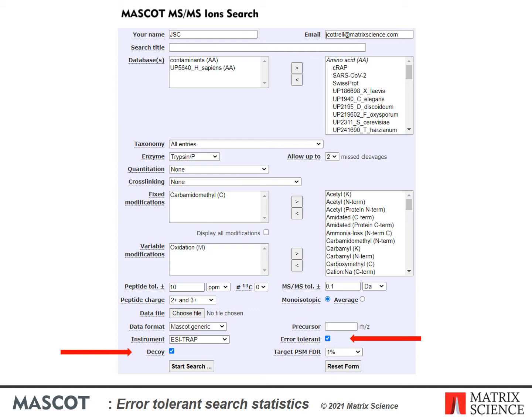Without a decoy, expect values are derived from counting trials. That is, counting the number of candidate peptides that we test to try and get a match. This estimate is not always going to be super accurate, particularly when there is something wrong with the choice of database or with the search parameters, which means that a large fraction of potential matches are unavailable. Ticking the checkbox to search a decoy database gives us a solid empirical basis for our statistics.